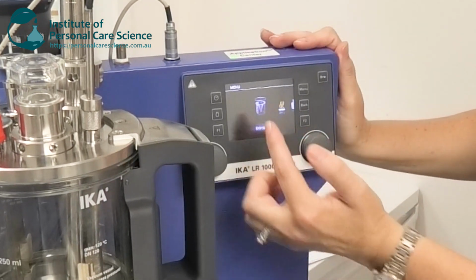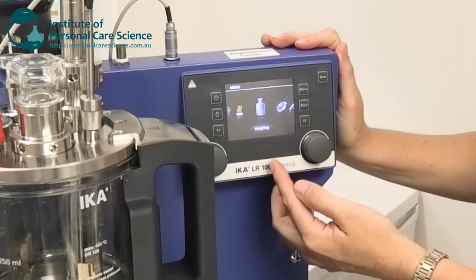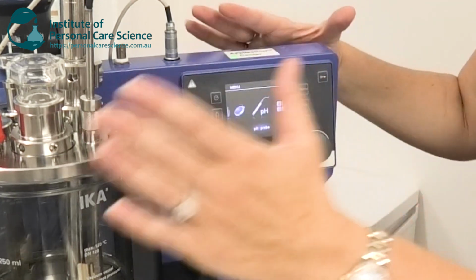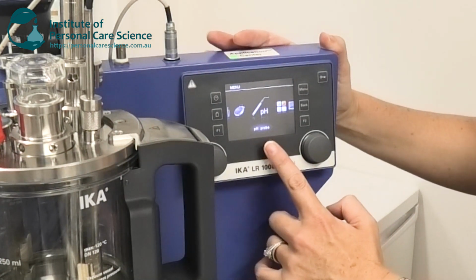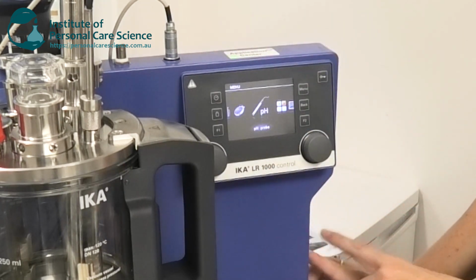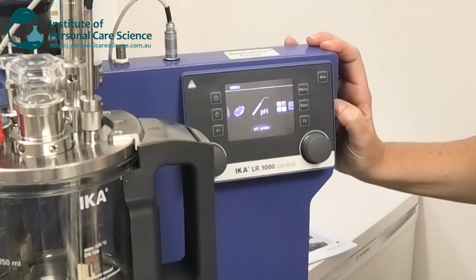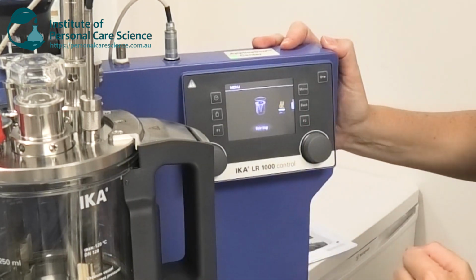Now, a couple of features of this equipment you're going to see me using. First of all, we can set the stirring speed, the heating speed. It will even weigh product, so we can check for any evaporation losses. We can set a timer. This particular machine isn't fit with the pH probe, but it does have a pH probe as an optional extra. We can also connect it to a computer. So this whole thing can run remotely, and we can set times of stirring, temperature, everything.